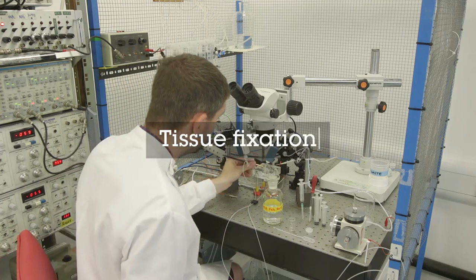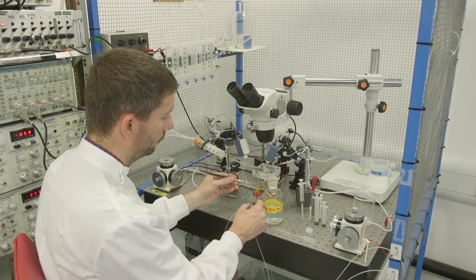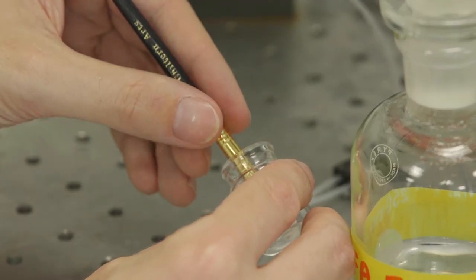Remove the brain slice from the recording chamber and submerge overnight in 4% paraformaldehyde in 0.1 molar phosphate buffer pH 7.4.